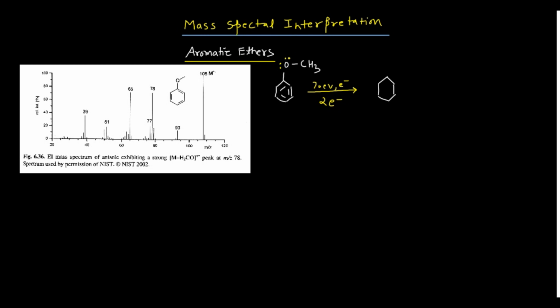So what kind of molecular ion can you see here? This is my benzene ring and these are the bonds. This is oxygen, this is CH3, and one lone pair is already there. One positive charge is retained by the oxygen, since I have knocked out one electron, and a single electron would be there in that case. So basically this is your molecular ion, and it corresponds to the molecular weight of the compound.